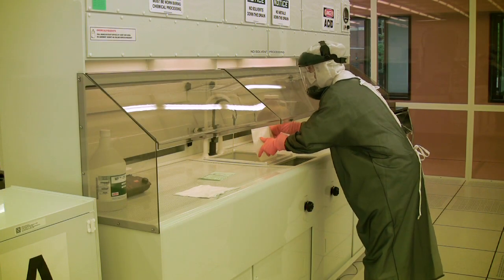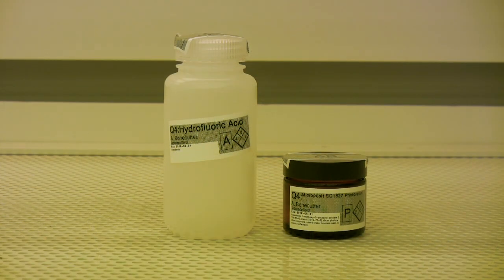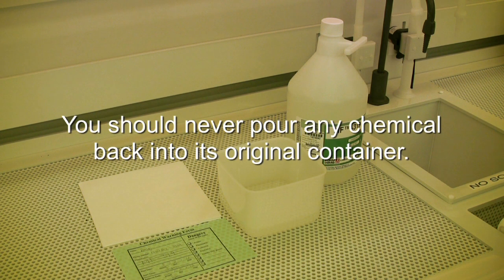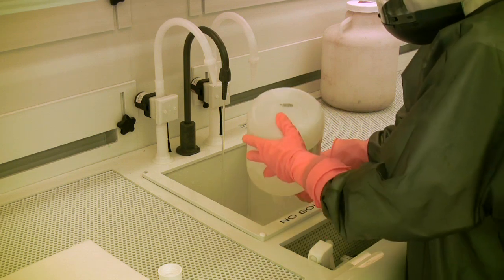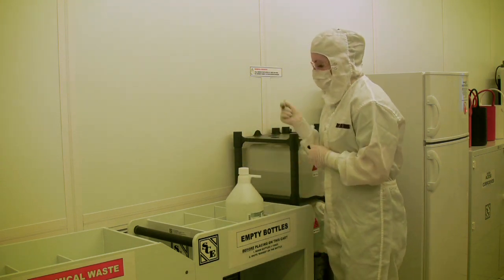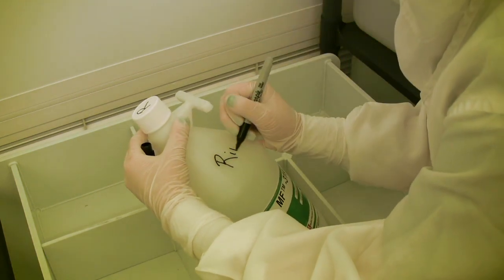When you are done with your process, you will need to properly dispose of any chemicals that you used. If you intend to keep any leftover chemicals, they will need to be stored in a chemically compatible container, properly labeled, and then stored in a chemical storage cabinet with the same types of chemicals. You should never pour any chemical back into its original container, to prevent contamination or adverse reactions. If you happen to use the rest of a chemical in a bottle, you will also need to rinse the empty bottle out three times with running water and then dry the outside of it. The bottle should then be placed on the rinse bottle cart in the cleanroom supply storage area. Once you have done this, take a lab marker and write 'rinse' directly on the bottle and write 'R' on the bottle cap.